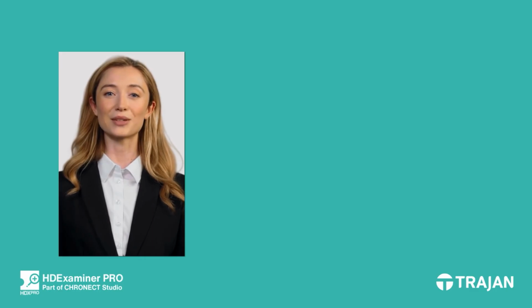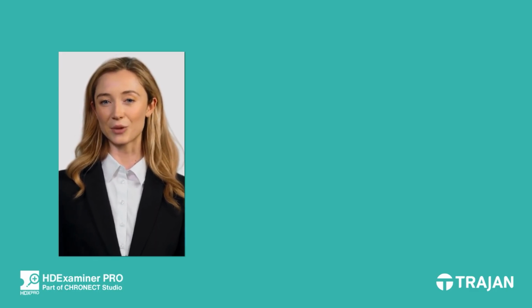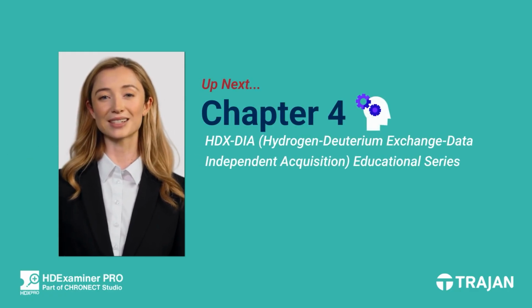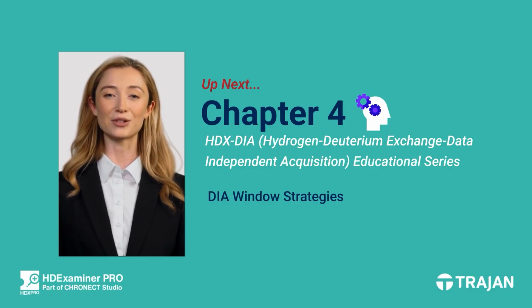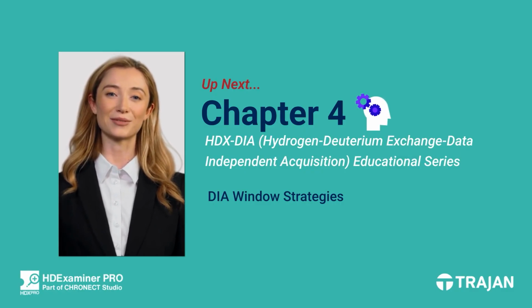In this chapter, we explored how DIA opens the door to fragmenting the entire mass range for more comprehensive results. Next, we'll take a closer look at strategies for setting up DIA windows, how their placement affects data quality, the potential pitfalls like edging effects, and how overlapping or staggered cycles can help ensure every peptide is captured reliably.